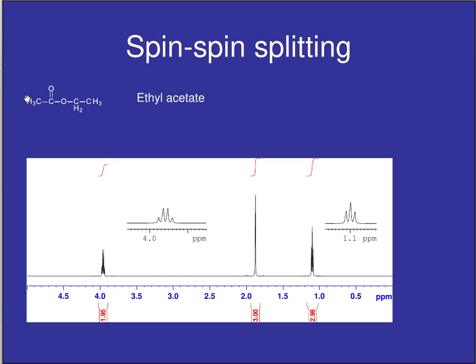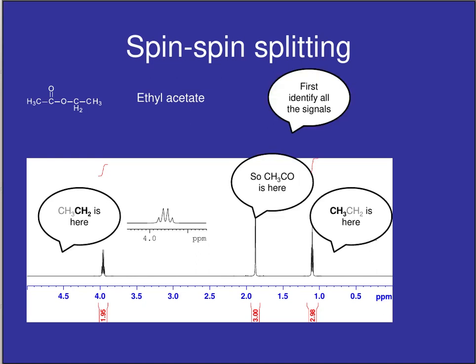Don't forget this methyl group at the end here, which has no protons around it. It's isolated in terms of neighbors, which appears as a singlet on the NMR spectrum. So it'd be interesting to explore. So we know where the CH3CH2 is. You could use chemical shifts to identify a methyl next to a carbonyl at being around about 2, and the other methyl group is over there.